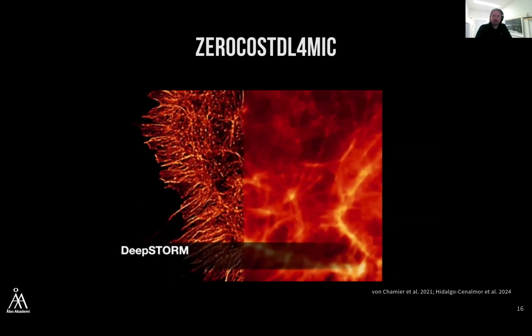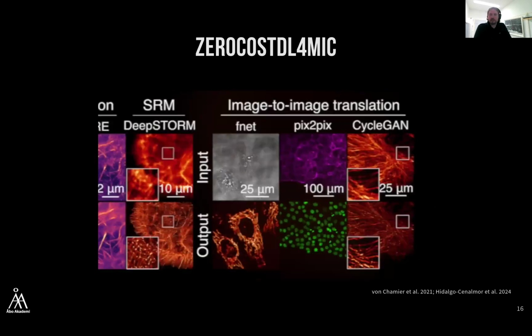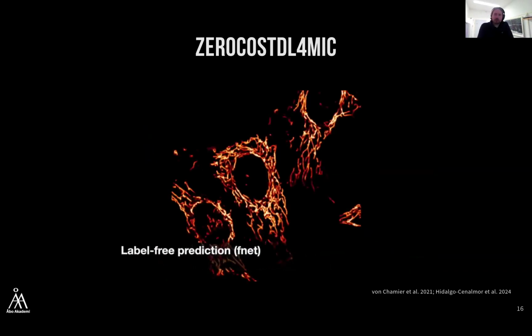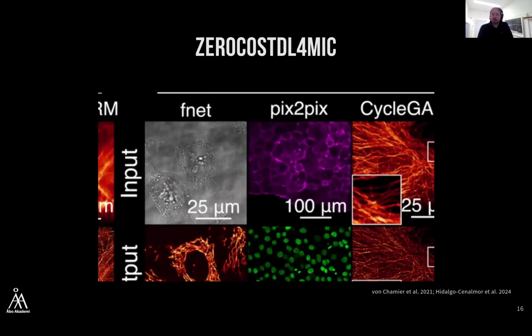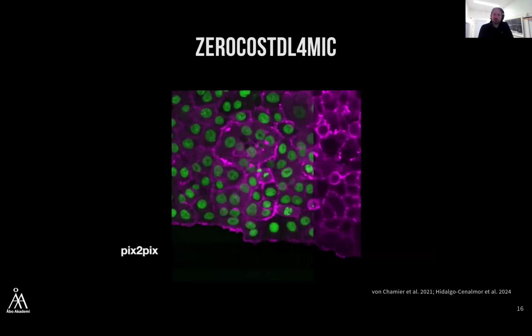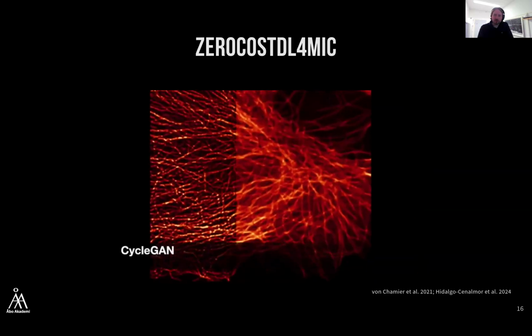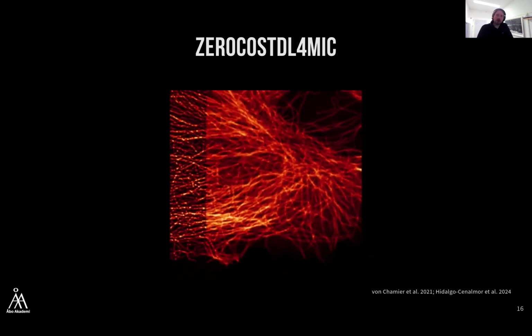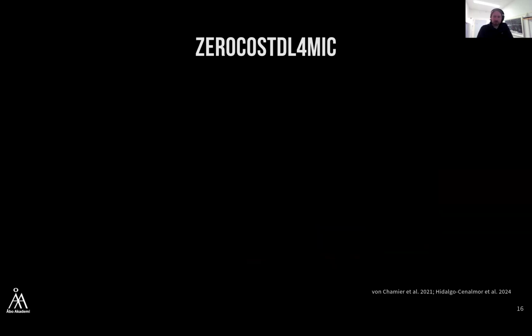And then there are plenty of other applications like super-resolution microscopy, either using super-resolution or analysis of those data sets. Something else that we're starting to use more and more is artificial labeling, which is to predict one fluorescent marker from another. So here's an example where the actin staining in purple is a real staining, but the green staining is fake and computer generated, which then allows you to maybe multiplex in silico and not have to necessarily acquire all the different signals when you do your experiment.